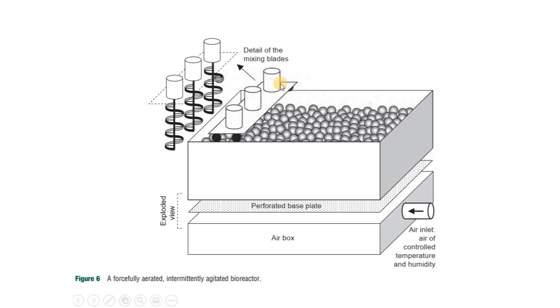The top box is attached with a box containing a small area for attachment of small mixing blades. These mixing blades can be inserted after packing the material, that is the beads or otherwise the solid substrate, within the top plate. This top box is a stainless steel box completely covered with the solid substrate material, and through the pores we can insert all three mixing blades, number 1, number 2, number 3. This one will move horizontally, maybe starting here, but slowly this can rotate and move slowly to this area. And after reaching this point, it will come back. After reaching this place, again it will go.